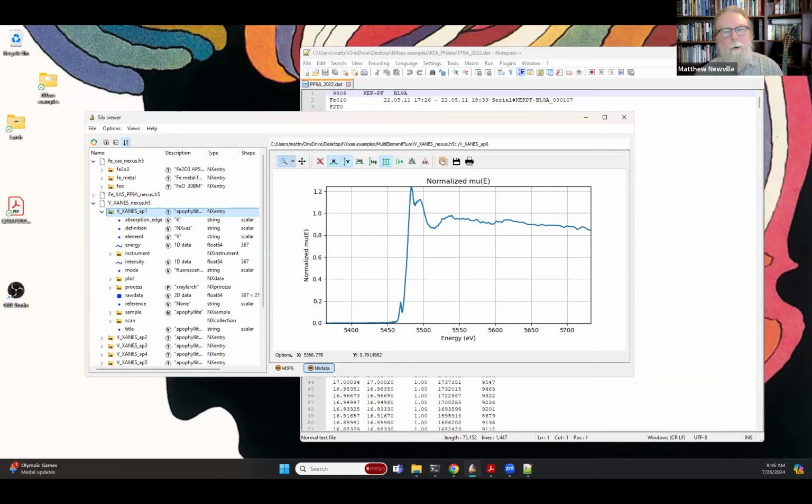Yeah. So I'll say this. Here, this energy array should be one-dimensional, and the intensity should be one-dimensional. The raw data, you can do whatever you want, and then you just expect to be able to describe the processing. So if you want to include that raw data as having 8 million X points, and then you interpolate those to energies and combine them and bin those however you want, if you can describe that in a way that you think people could reproduce, that's fine.